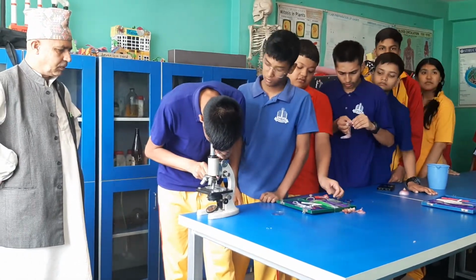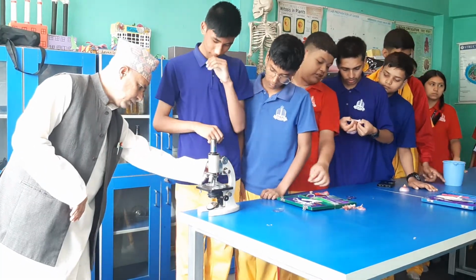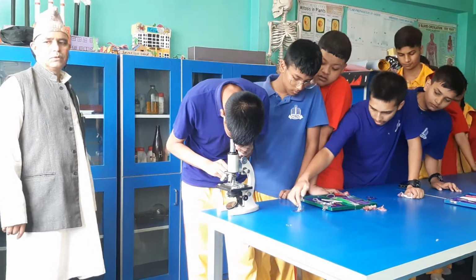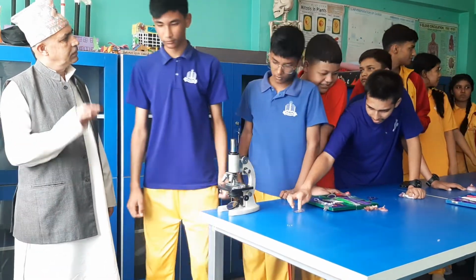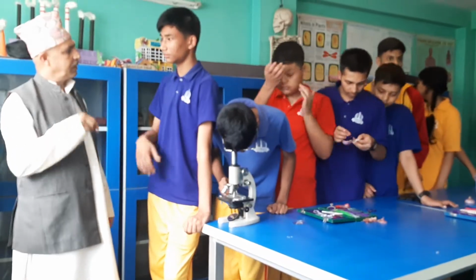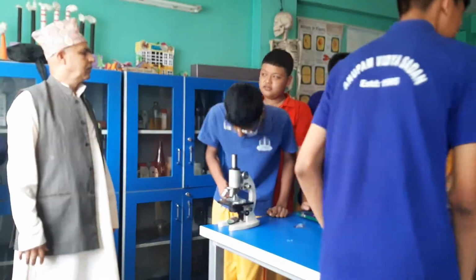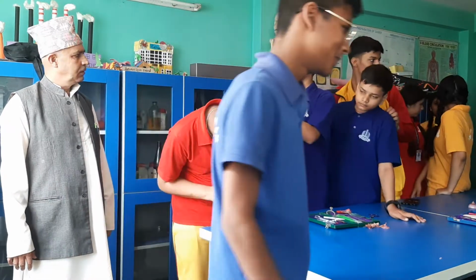Move more right. You just rotate right. See? Have you seen how many small rooms and black outer boundaries? That is the cell, right?